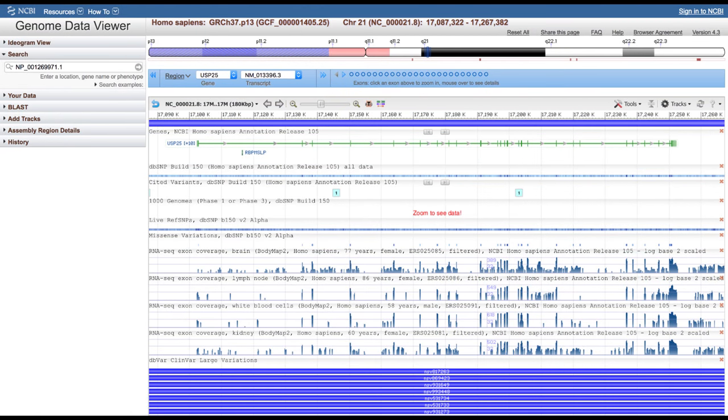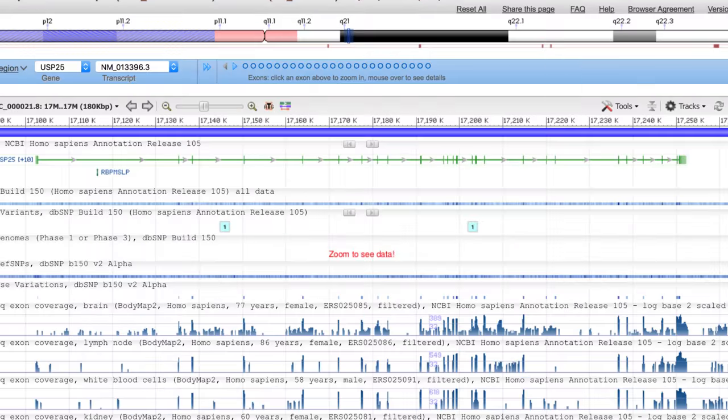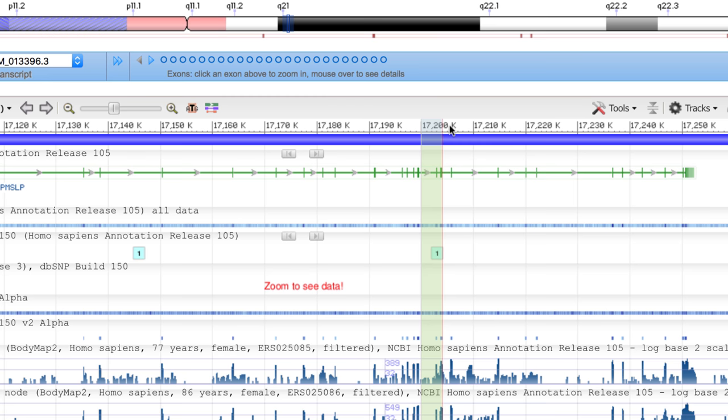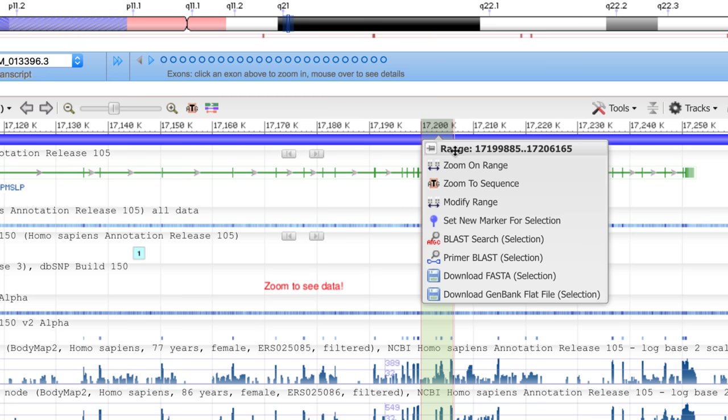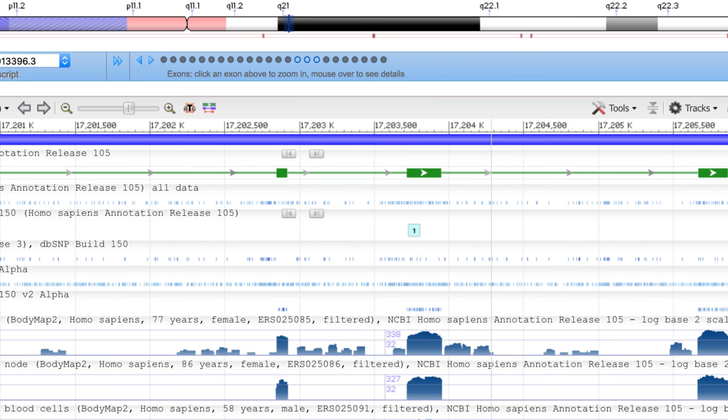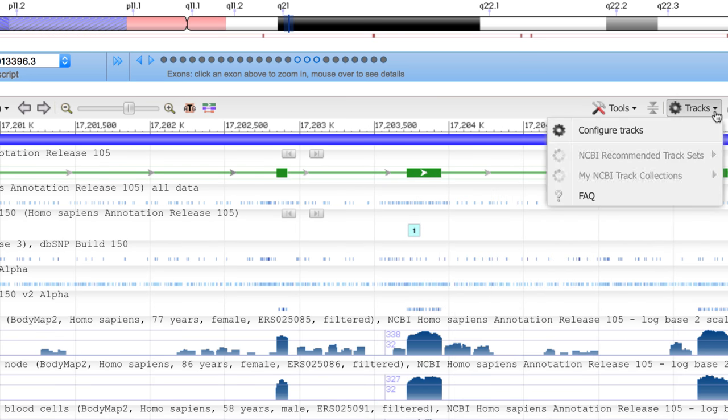Once in the viewer, you have all of the features of the sequence viewer, including numerous zoom controls and extensive track configuration.